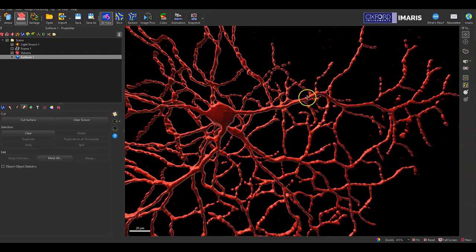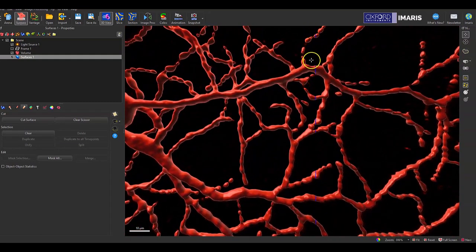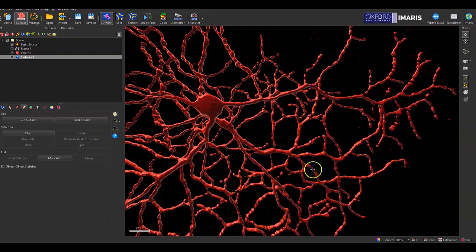I clicked on this segment of my surface, but my imaginary vertical line of the cut is going to interact and intersect with my surface object on that vertical line. The surface will be cut everywhere where that blue line is highlighted on the surface object.